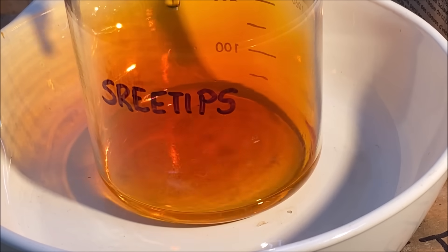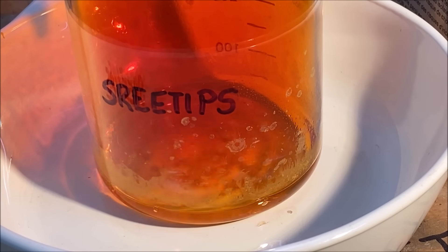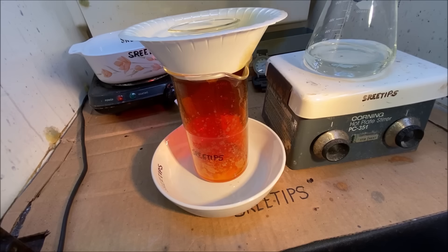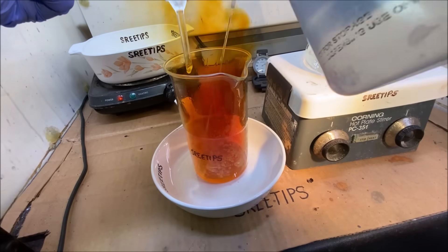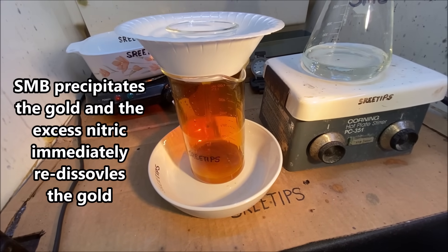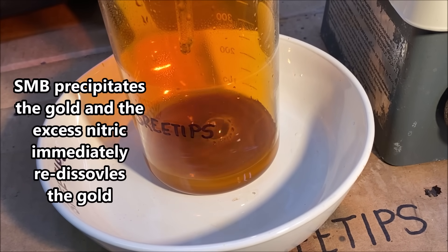Excess nitric is still present — that's what those fumes are. I'm adding the SMB, filtering it. I used a solution instead of just dumping the powder in. You can see there's a whole bunch of excess nitric still present, and that's why we're getting all that fume production. As the SMB goes in it immediately re-dissolves — that will continue to happen until all the excess nitric gets consumed out of there.